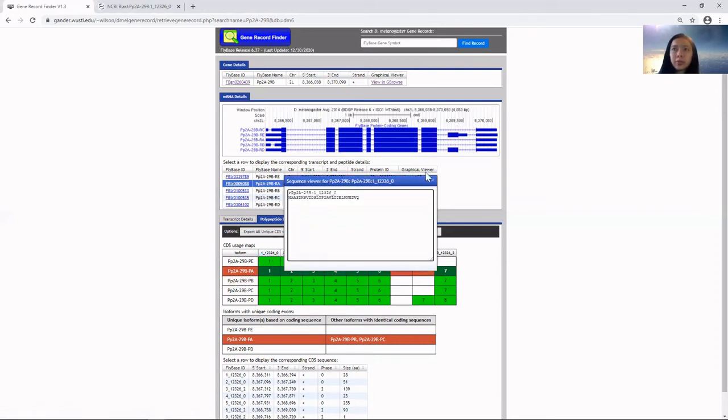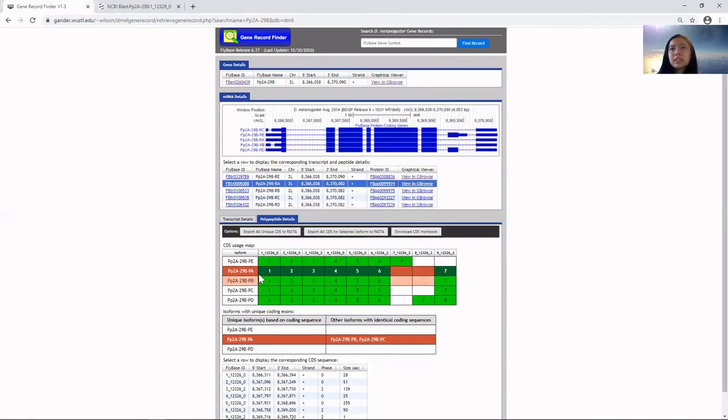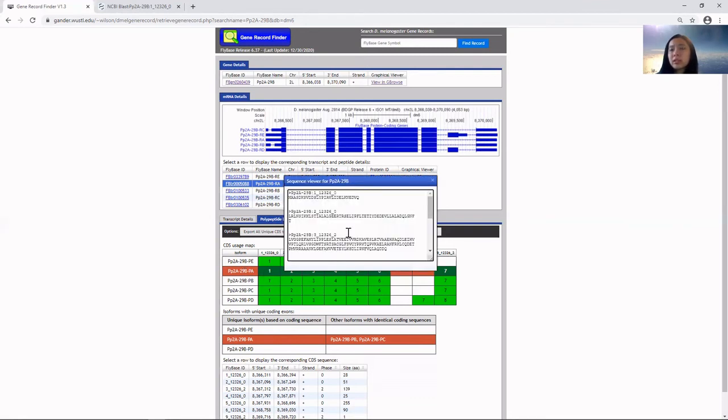To get CDS sequences for the whole isoform, let's say isoform A, you'll click on this and you'll get all the CDS sequences for this particular isoform.